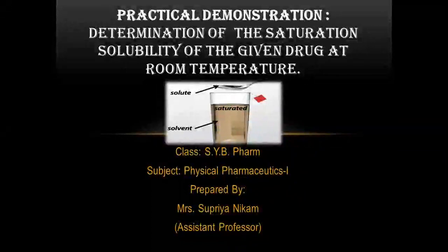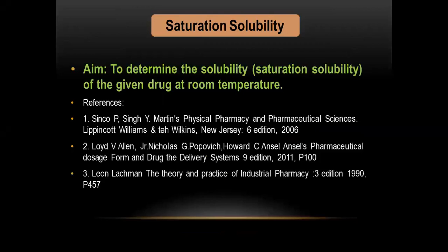This video is regarding the practical demonstration of the determination of the saturation solubility of the given drug at room temperature. This practical is included in the SY-BPharm syllabus under the subject Physical Pharmaceutics 1. So the aim of today's experiment is to determine the saturation solubility of the given drug at room temperature. These are the references listed over here which are referred for this experiment.